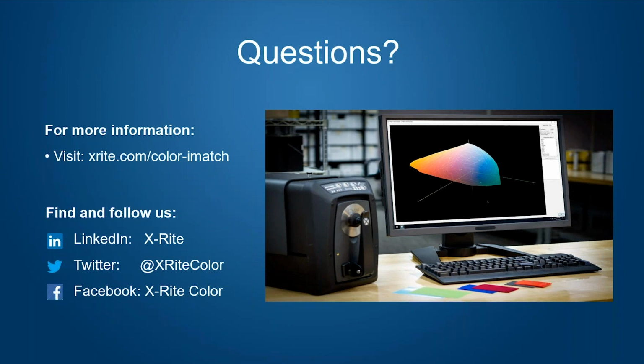Again, maybe Tim, you have some thoughts on that. Yeah, but that certainly should be possible given how waste is integrated into the formulation engine. Right. Essentially, that waste is just another colorant as far as the engine is concerned. So just like the math engine is capable of picking out, if I'm in coatings and I've got 20 different colorants in total, I can go generate a formula for this green I want to match and tell it to include all the colorants. The math engine's not going to put red in a green, most likely. It's going to use the colorants that make sense, and it's going to treat the wastes just like colorimetrically and spectrally, just like it does the other components. And so it can properly select the right waste to use.